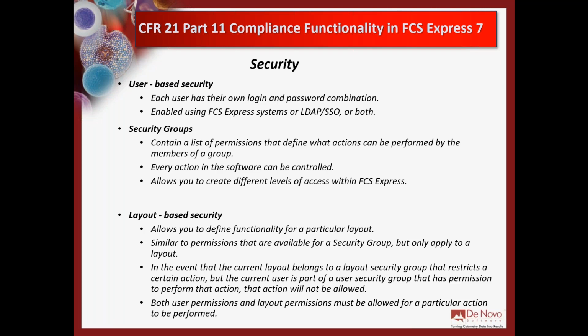So the first add-on, security, right? So what does security do? Well, it allows user-based security at the primary level, right? So each user has their own login, they have their own password. Passwords can be changed. There can be force change. There's password expirations, right? We have all of that capability in the software.